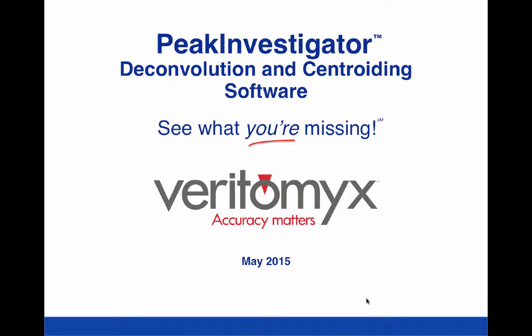Veritomyx is applying high-performance signal processing and computing capabilities to mass spectral analysis. Our first software offering, PeakInvestigator, detects and deconvolves overlapped, nearly isobaric peaks, offering up to 10 times better mass and abundance precision in your spectral peak lists.